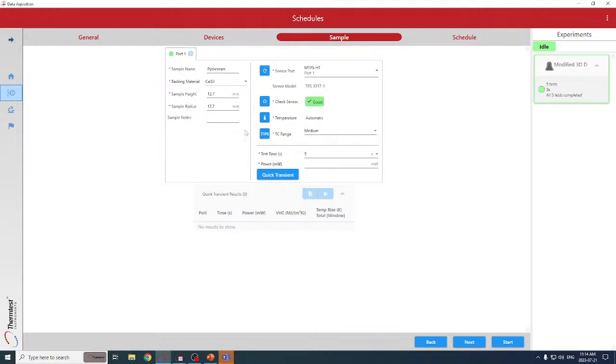Now what the iTPS does, the I stands for intelligent, it's our algorithm, which is more than just math. It's actually a proprietary approach to the measurement for determining the parameters. So because we're not calibrating one set of times, one set of powers, we don't need any calibration. Also, all of our MPV and MP1 have the ability to manually modify experiments, so you can have a deeper understanding.